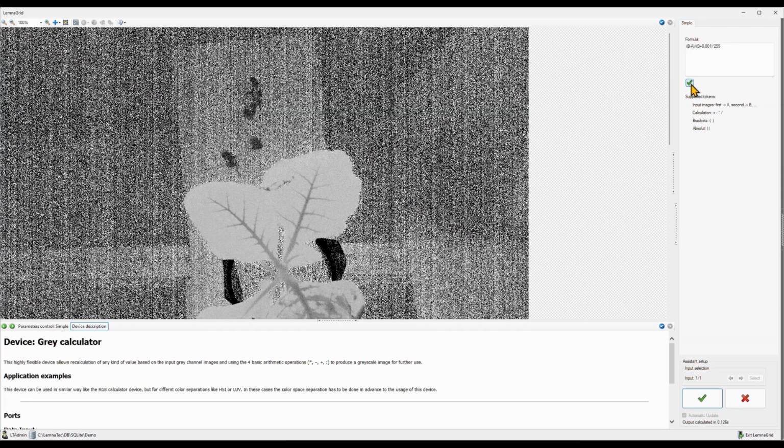Now we see the calculation results. In the background, we see a lot of bright pixels. These are divisions by 0, or more precisely, divisions by our small protective value. We will get rid of them later, but I will return to the original scale with values between 0 and 1.